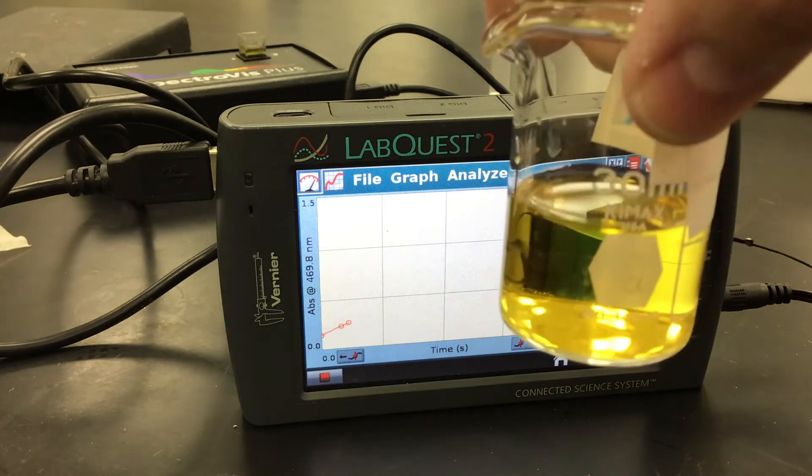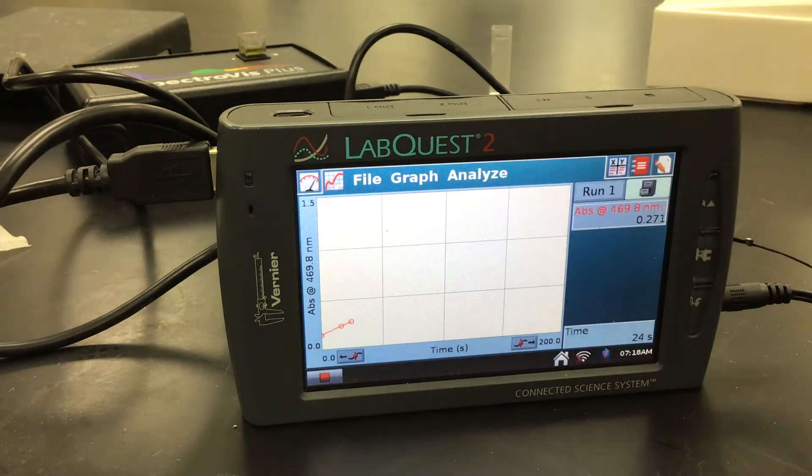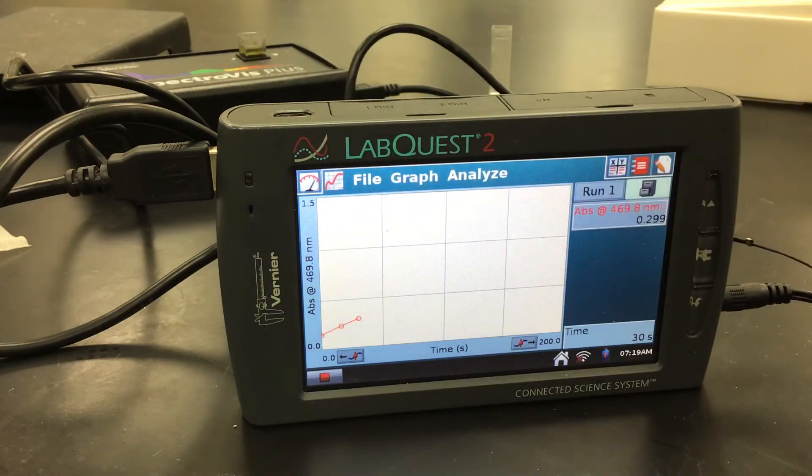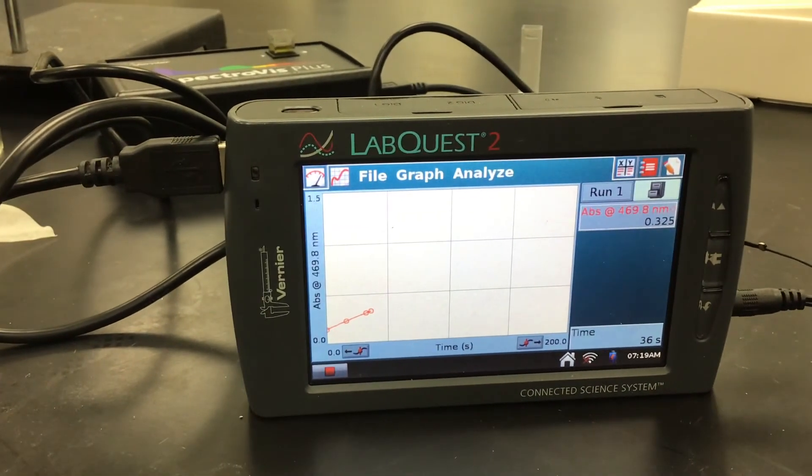We can actually kind of see that in the beaker as well. This is darker than our solution of iron and it's going to continue to get darker. All right. So we're going to let this run for 200 seconds. And then we'll have our graph. We're going to do two more sets of data.